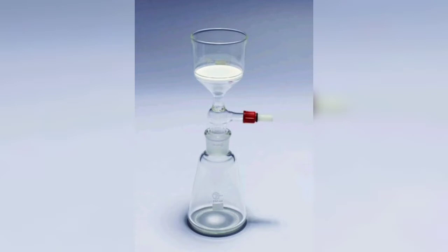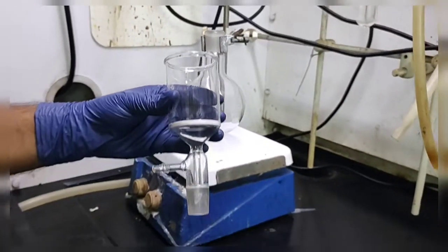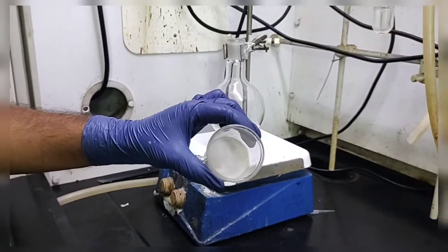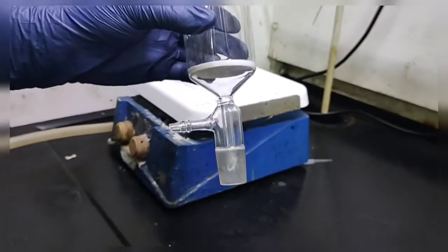In this image you are watching a sintered funnel fixed in a conical flask with a standard joint. Here we are taking the round bottom flask with standard joint and this is the sintered funnel with a 24 standard joint.